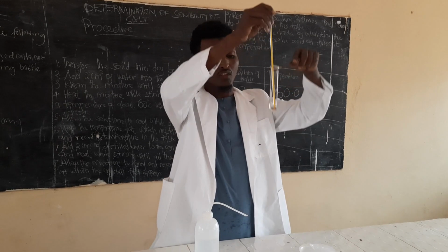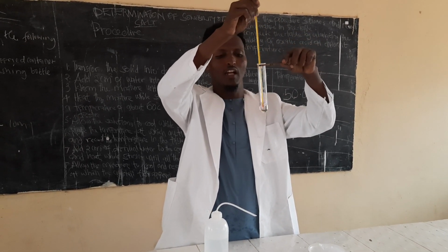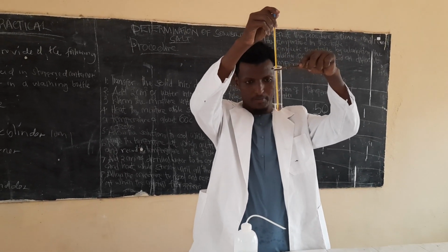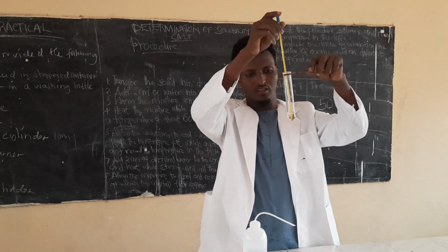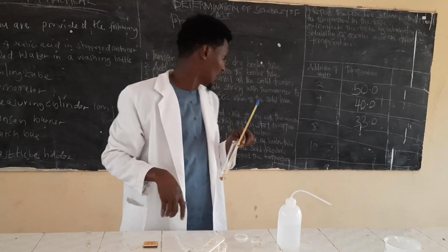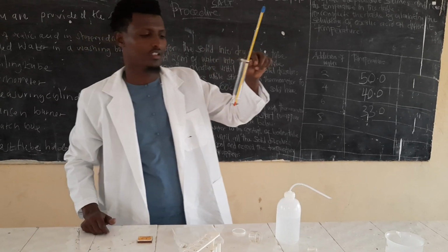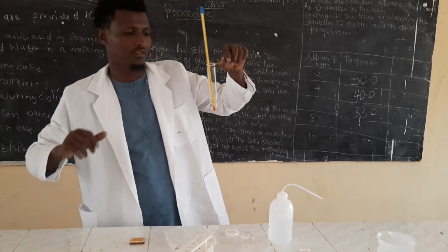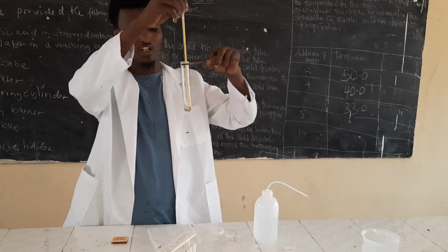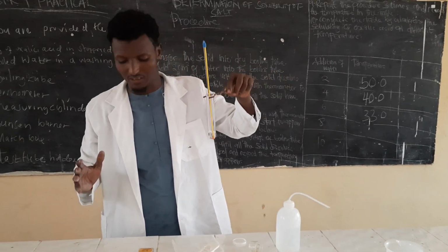Okay, the solid is still coming. Crystals have not appeared yet. They are still to appear. This means there is a lot of water here, 8 centimeters of water with 1.6 grams. So the solubility is very high, so the salt is very difficult to form. It will take a lot of time.